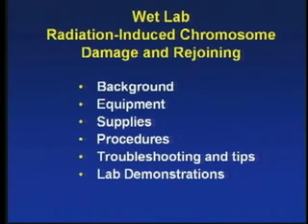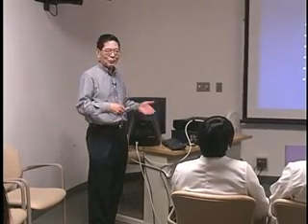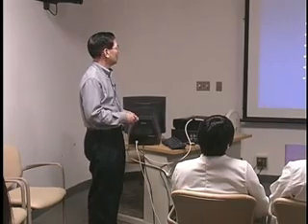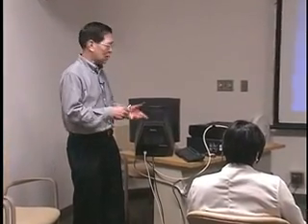And we add a section of troubleshooting tips for today's lecture because, unlike some of the wet labs that we had before, this particular method of chromosome spreading is relatively simple, but on the other hand, it does involve a little bit more art than science, so in order to get a good final product, you have to know some of these things. That's why we include them here. And finally, we'll tell you what you're going to do in the next hour.